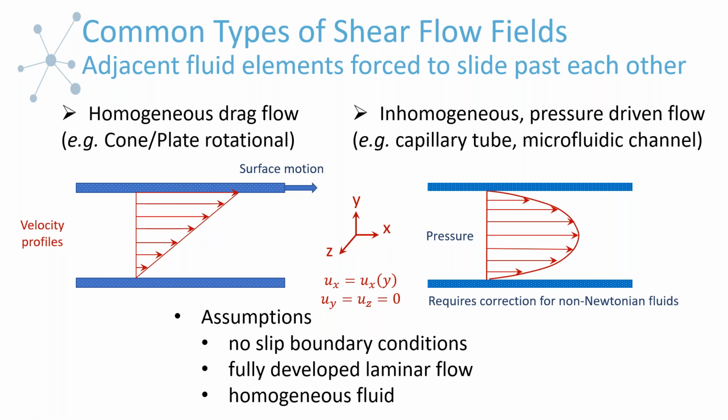And the other thing that's important when this is happening, and I don't want you to get confused with my terms here, but I couldn't come up with another word to describe the fluid other than homogeneous. But you do want your fluid, on the length scale of the instrumentation, to be homogeneous. So it should be macroscopically homogeneous. So you don't want gross phase separation, so that you could have different layers of fluid slipping past each other, is what I mean. So we're talking about homogeneity with respect to the flow field, more specifically the shear rate profile across the gap, but then also the nature of the fluid is important as well.